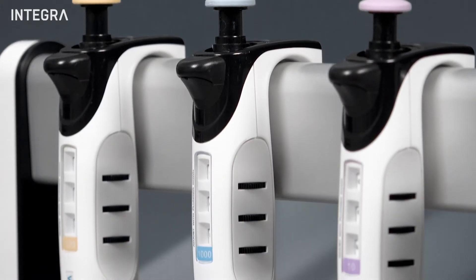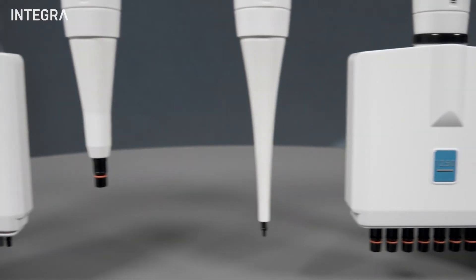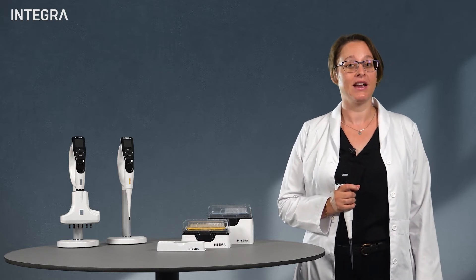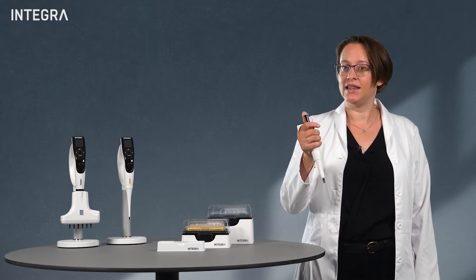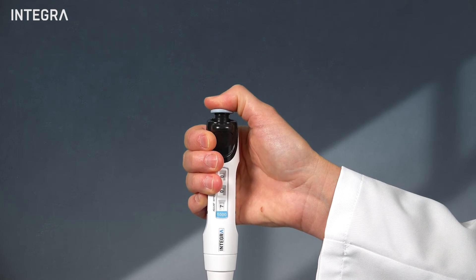Manual pipets are great tools and when calibrated and used properly, you should be able to get good results using them. Just remember that consistency is key. For example, pay attention that the plunger is always fully depressed when pipetting.